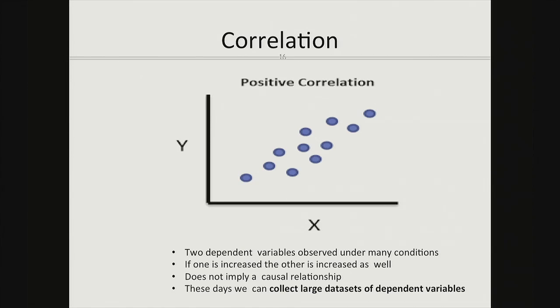So that means if under one condition this goes up and the other goes down, or they have poor correlation, we basically have a cloud, and then there's no information in there. But we assume that if we can generate such correlation analysis, correlation plots, or correlation coefficients, then we would be able to measure association.